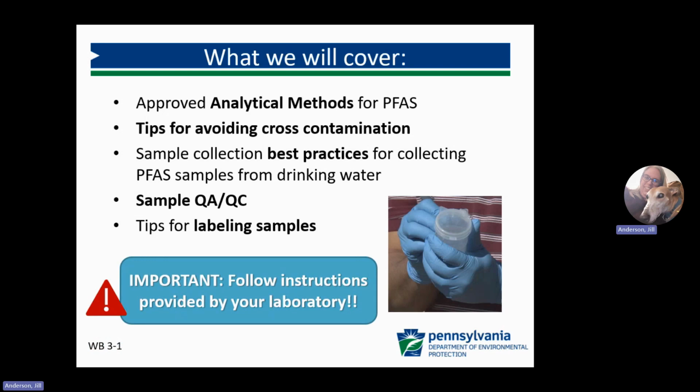Keep in mind that the Pennsylvania DEP accredited laboratory that you select to perform the analysis of your PFAS samples should provide you with sample collection instructions, which may be brief. This lesson will share tips for avoiding incidental cross-contamination of PFAS in your samples. Ultimately, you should be sure to follow the instructions provided by your accredited laboratory.